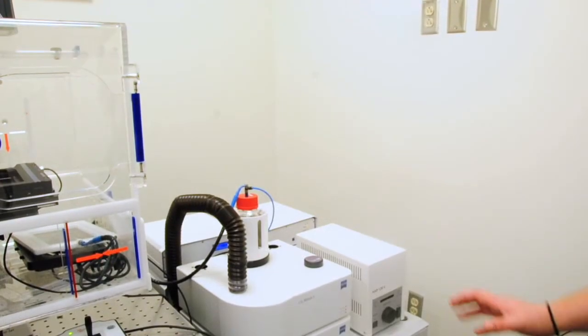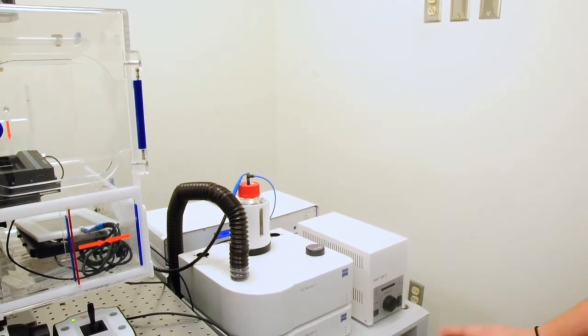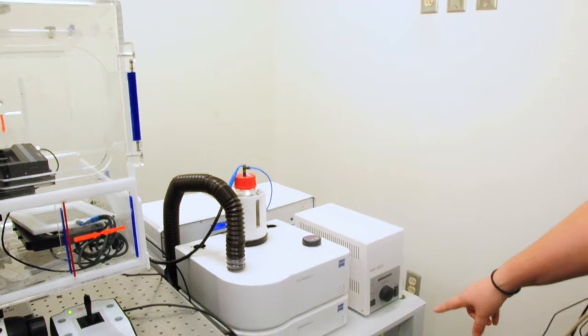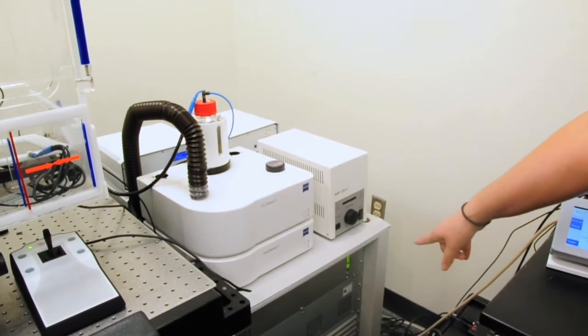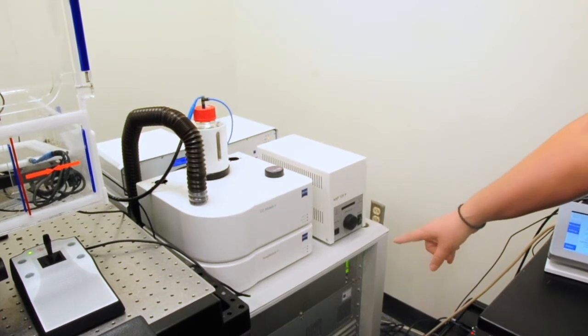So now we're going to look close in to all the components on the laser bench. Below us is where we actually have the lasers, and below that we have a real-time computer system that relays back and forth with our normal computer.